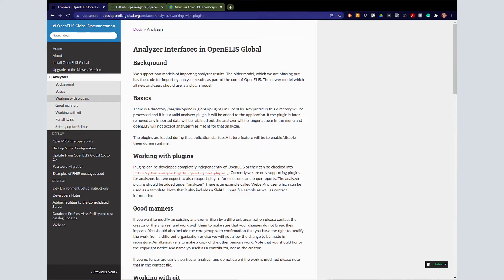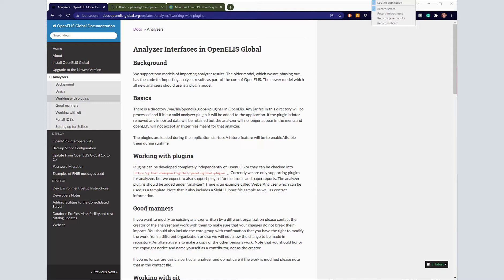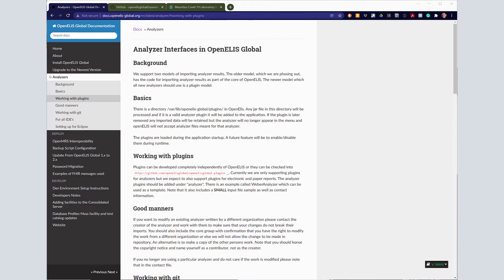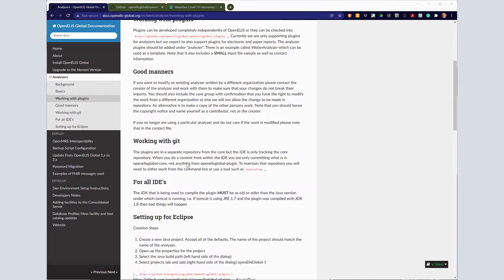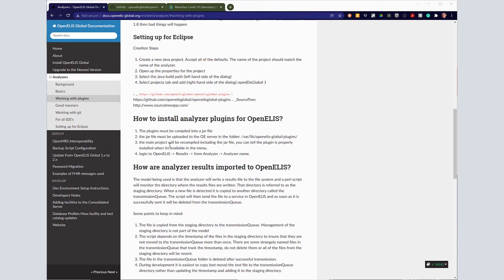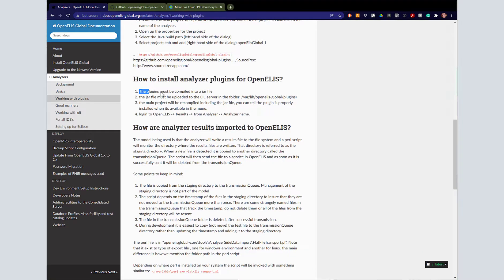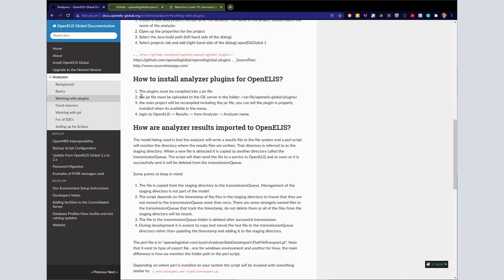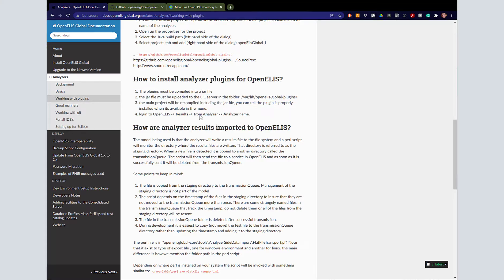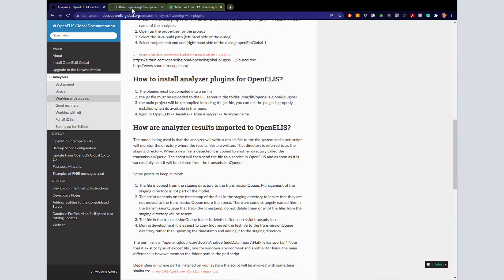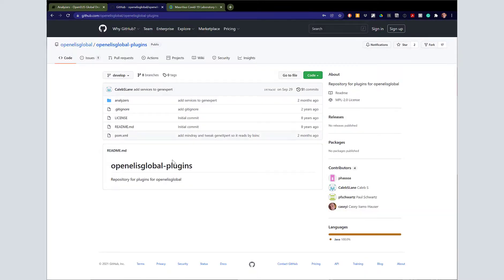Here you can see that you can find information on our docs page about how to work with plugins in general. The steps are fairly straightforward: the plugins must be compiled into a jar file, the jar file must be uploaded into the plugin directory, and that's it. Once you've got it in there, you can open it up from the results menu within OpenAlice Global.